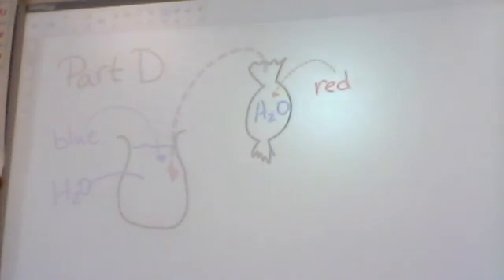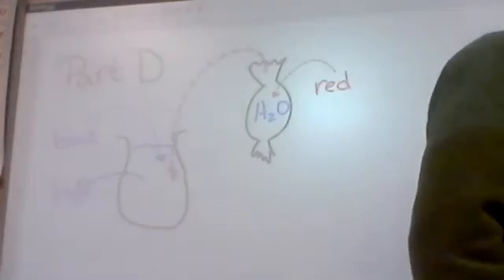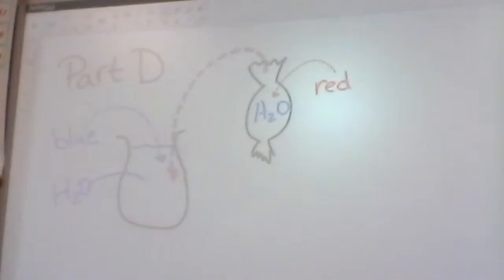Okay, part D, you can come back to that part, and look at the time. We are up against it, so you can answer the questions for the first part for part D. If you have a balance, sorry, part D, you zeroed a balance needlessly, but it might be close at least for third hour. And we'll take that. You want to see the part A, the cell that turns purple? Look at that before I toss it.